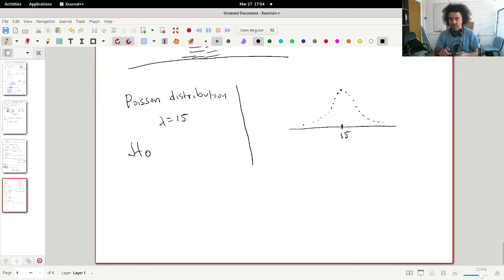So we reject the hypothesis that states that this region is just a matter of chance, is not an interesting region, is not a region that a transcription factor binds. We reject that, and we accept that this region is in fact an interesting region, a significant region.